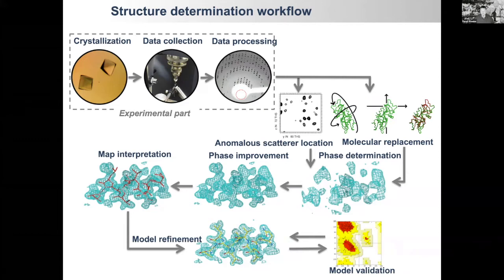And I should say model validation. I'm not going to talk about it. Christopher Willems will talk later. It's usually presented as a separate step, but it's not. Really, model refinement and validation are two steps that come together, and we usually do both interchangeably, right?